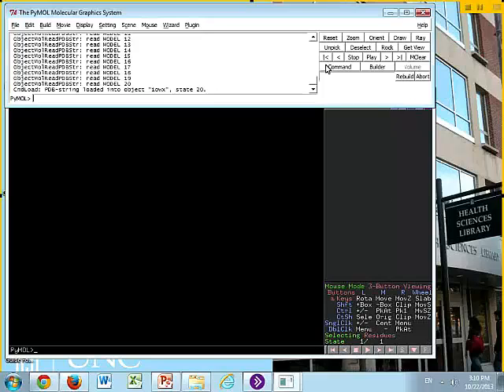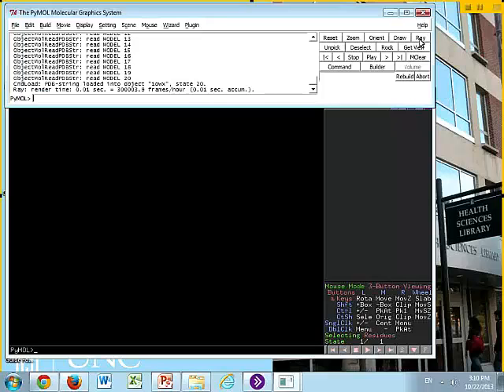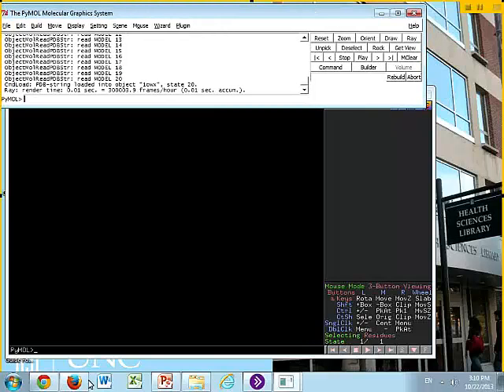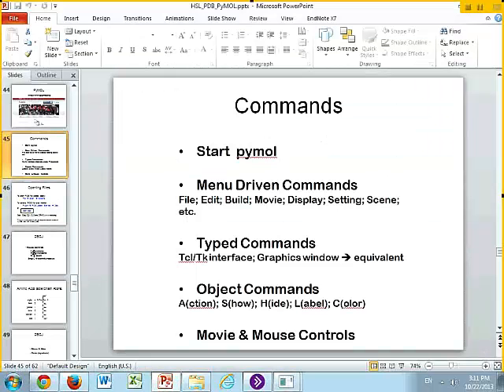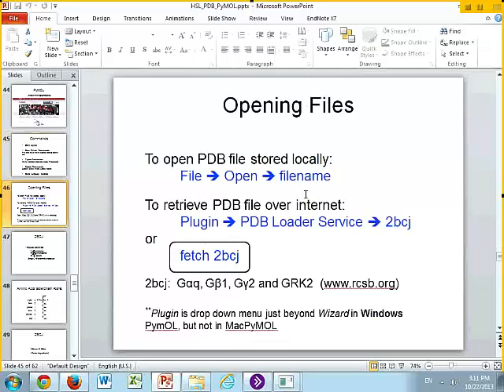You have down at the very bottom below that, you have movie controls. You also have movie controls in the Tcl window up here. You have stop and play. Now in the Tcl window in the upper right-hand corner, the main buttons, there's two main buttons that you'll get to know. One is reset, and the other is raytrace that we'll talk about today. And so there's nothing exciting going on now, but that's the introduction to the menu-driven commands, type commands, object commands, and movie and mouse controls.